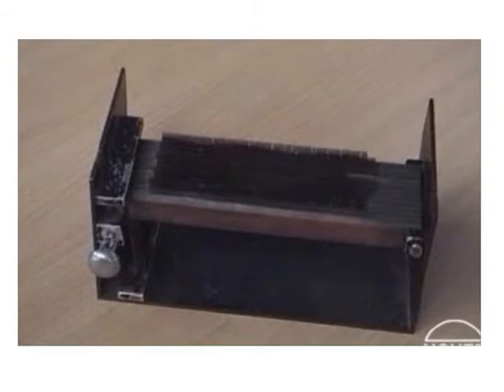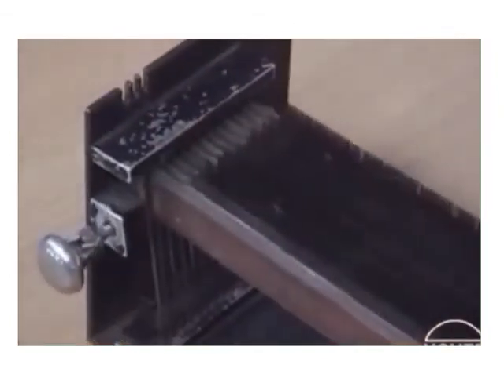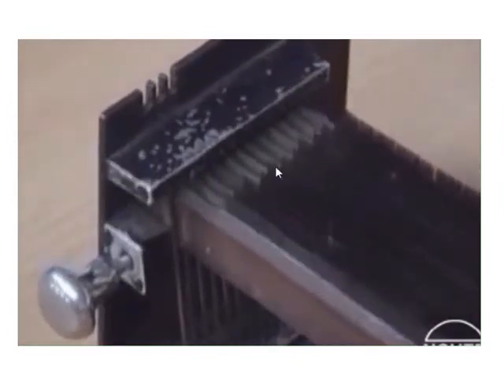Let us have a closer look at the instrument. Now see, there are 12 bottom combs here, and there is a knob. By adjusting this knob, each bottom comb can be dropped inside this rack. This is the rack, and these are the grooves wherein you can place the top combs. Where the grooves are, that is the back side of the instrument. Don't use this knob as an indicator, because this knob can be placed on the other side also.